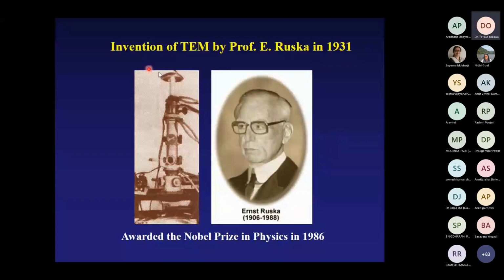This left-hand one is an experimental instrument, the first prototype transmission electron microscope. After that, electron microscope technology was developed, and many commercial transmission microscopes were distributed, and the electron microscope gave a lot of contribution to human society.